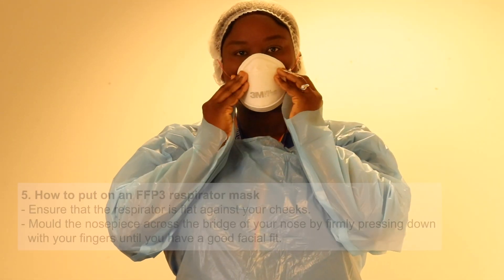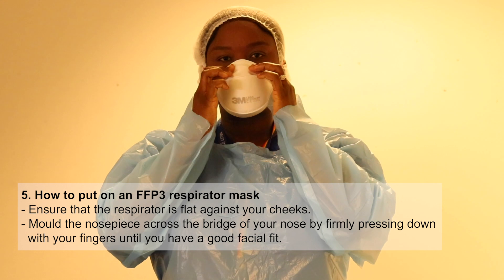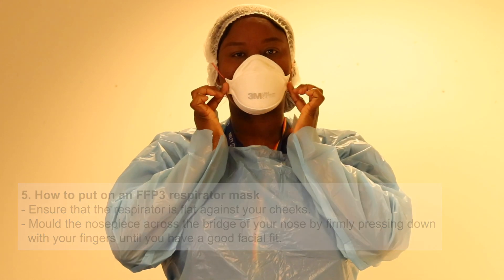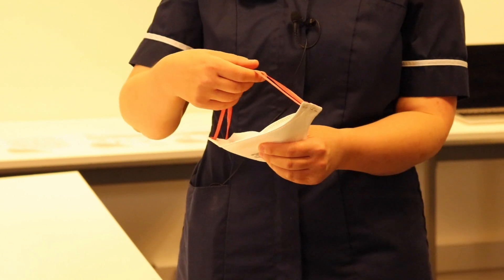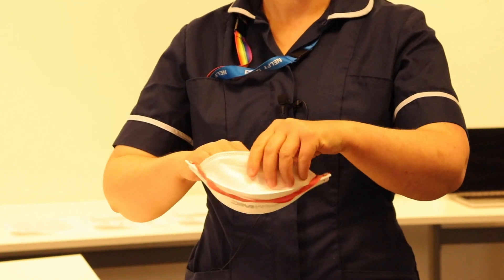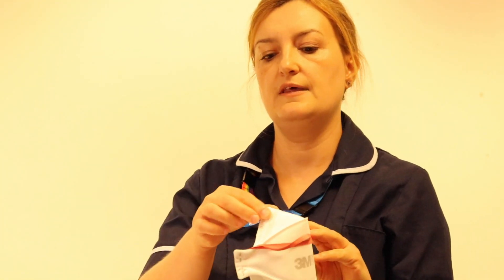You would then mould it to your face, making sure you pull the bottom bit under your chin, and mould the top — which has a soft piece — round your nose. These masks can be a little bit tricky to put on so everybody gets their own way of doing it, but one of the easiest ways is to put the ties at the front, open the flaps out, shape it, put it into your hand, put it on your face, pull the ties over, and then mould the top.